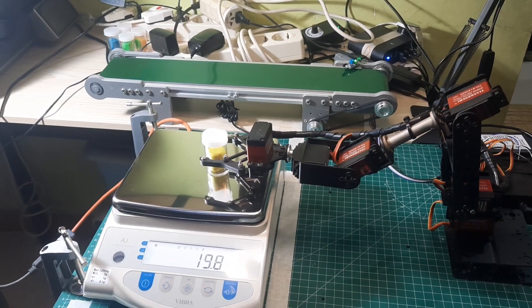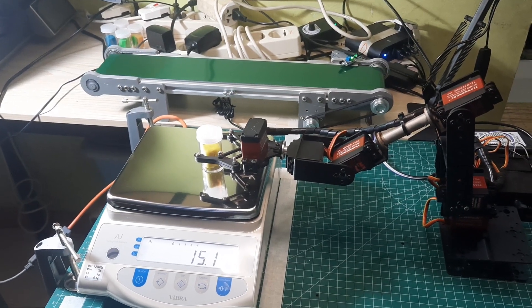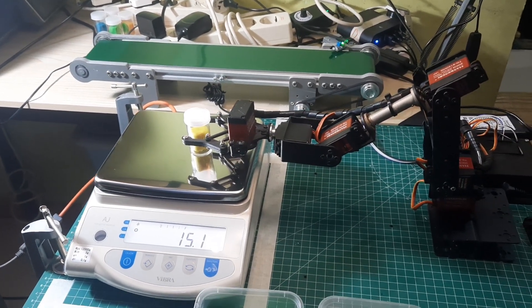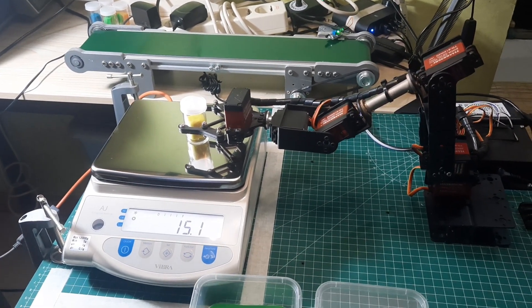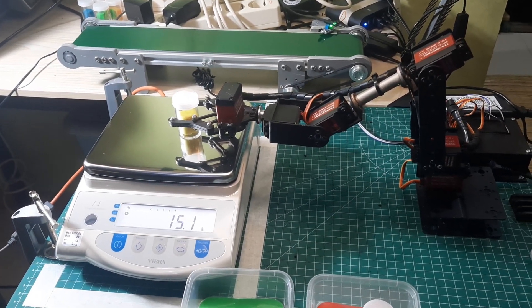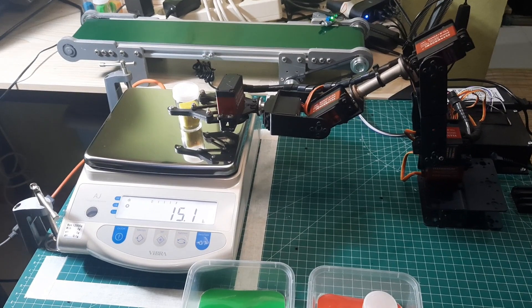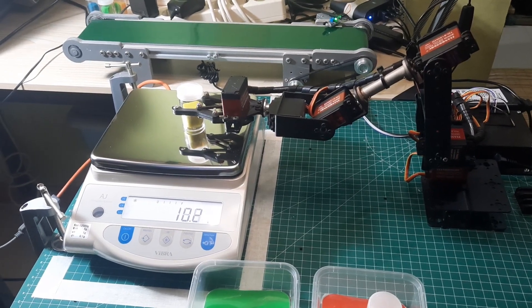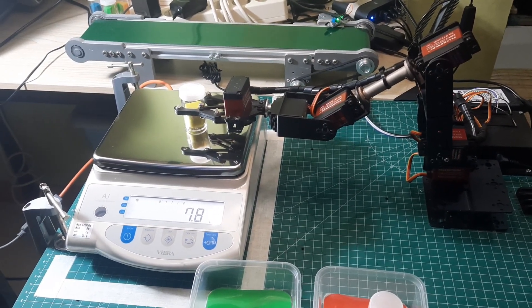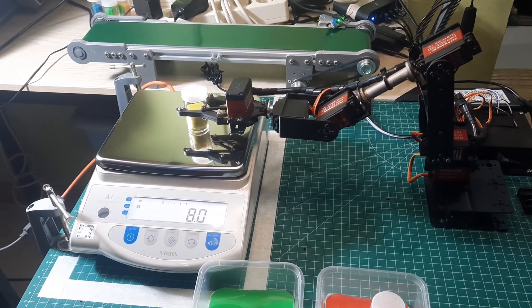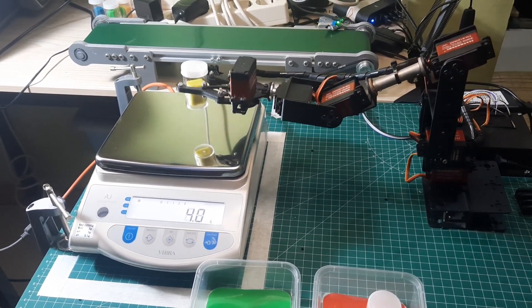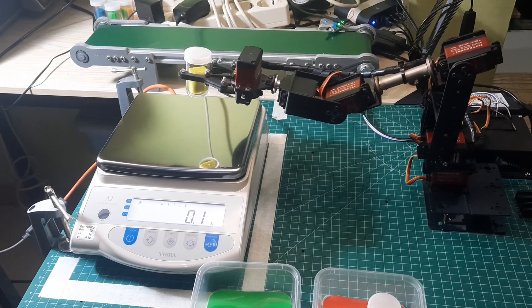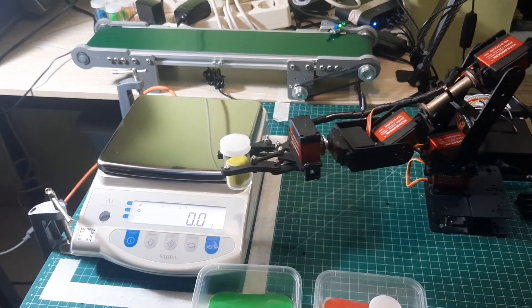We also integrated data from the analytical balance and used Node-RED to monitor and control each step of the process, ensuring accuracy and efficiency in product sorting.